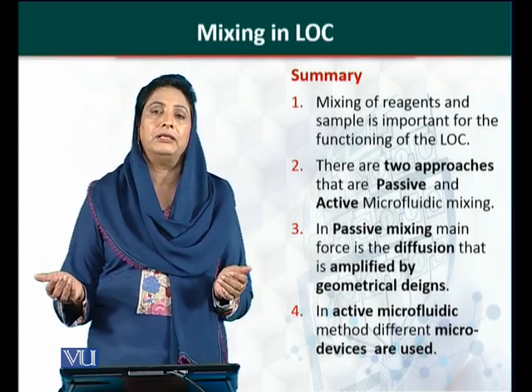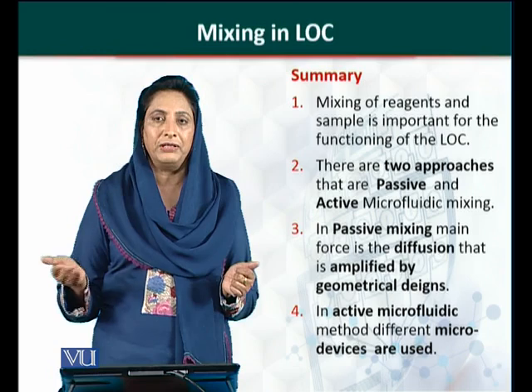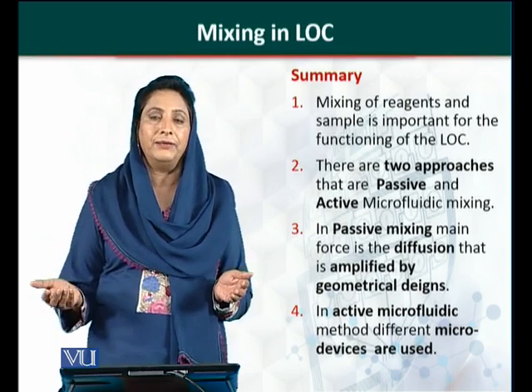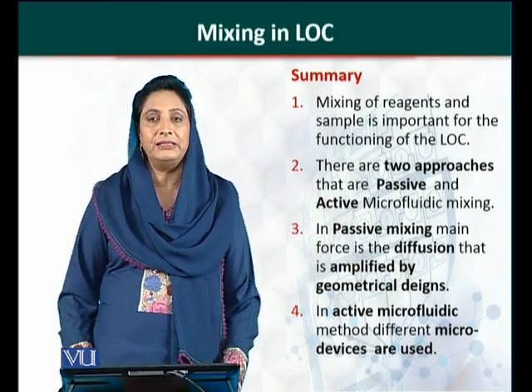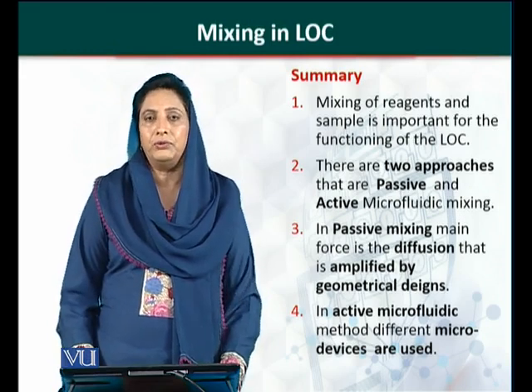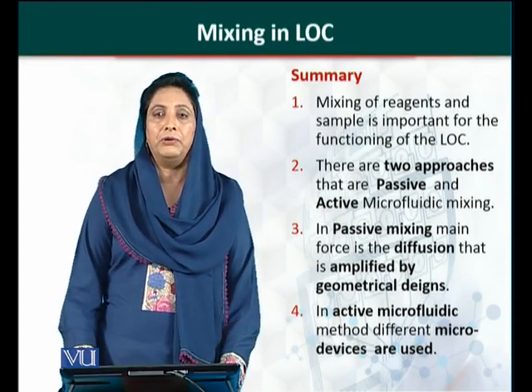In active mixing, we can use different active microfluidic devices such as valves and pumps. Mixing of reagents in lab on chip technology is very important for the better performance of a lab on chip system.